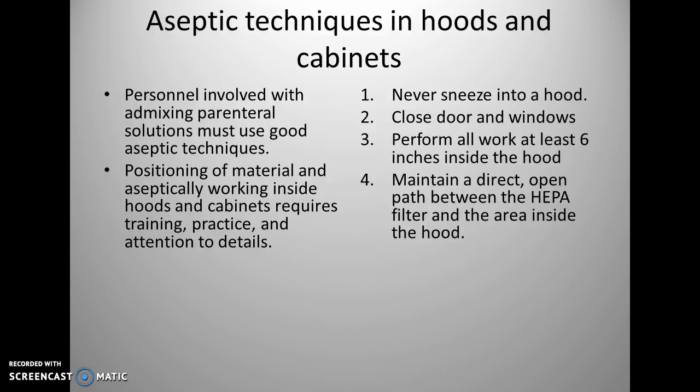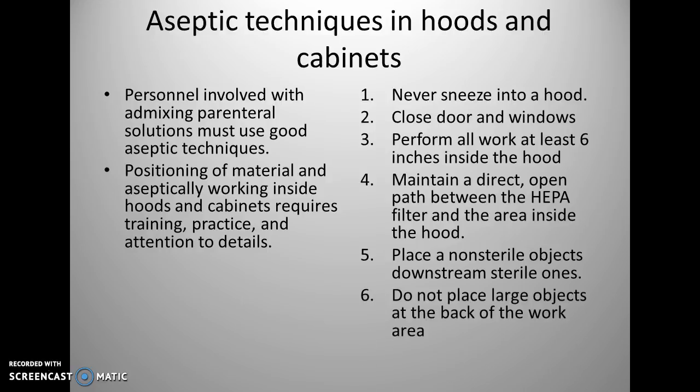Maintain a direct open path between the HEPA filter, talk about that, and the area inside of the hood. Place non-sterile objects downstream of the sterile ones, so that they will be closer to the edge versus the sterile ones, which should be farther back within the hood. Large objects shouldn't be placed at the back of the work area because that will prevent the flow of the sterile air that's supposed to be coming into the hood. Okay, so those are just some of the things that you need to do.